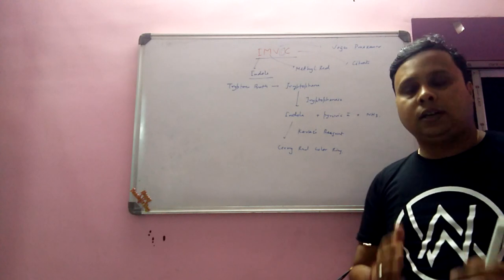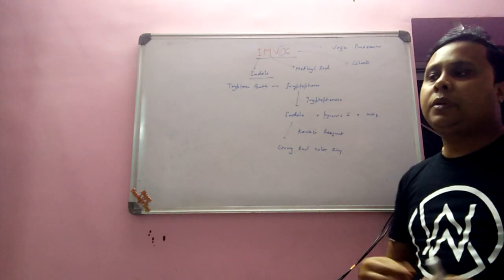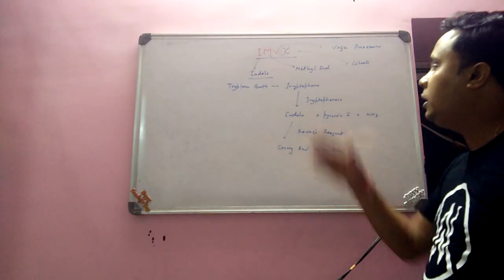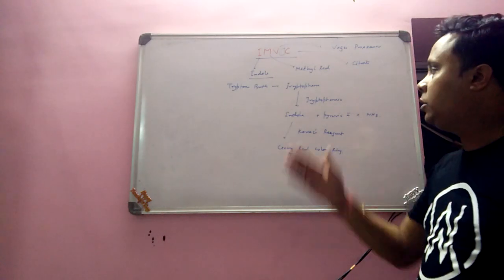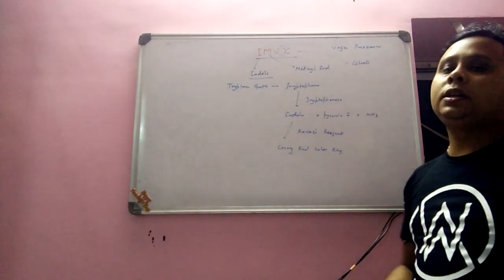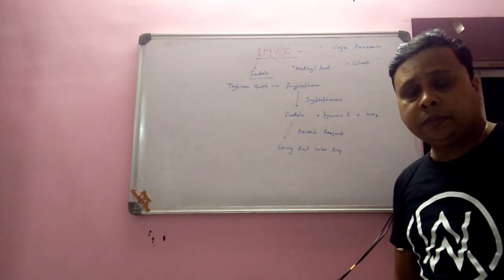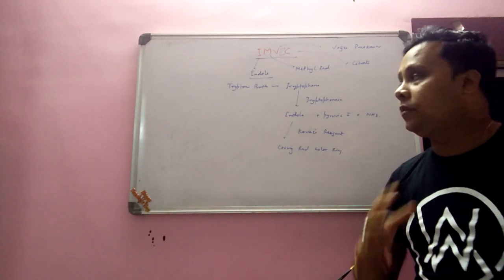Only fecal organisms are capable of producing the tryptophanase enzyme, and therefore only fecal organisms can convert tryptophan to indole. Non-fecal coliform is not capable of converting tryptophan to indole because they lack tryptophanase. That is why the cherry red ring appears only in the case of fecal organisms, not the non-fecal ones. So E. coli gives a positive test for indole, Klebsiella aerogenes gives a negative test.